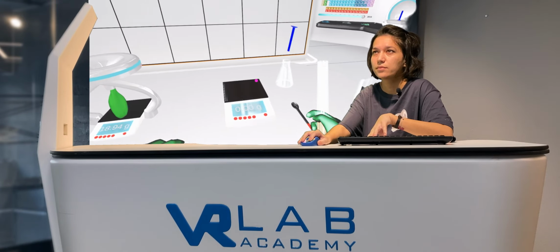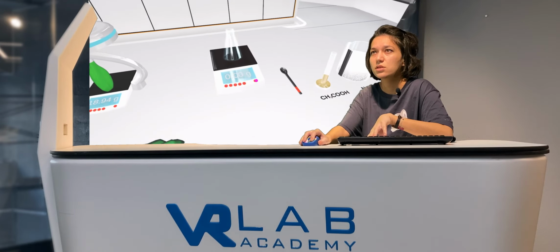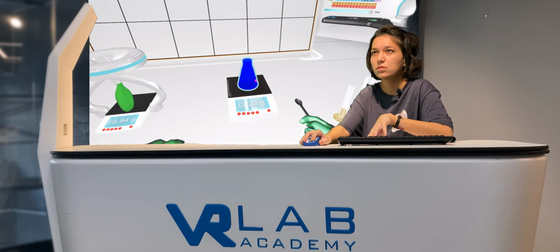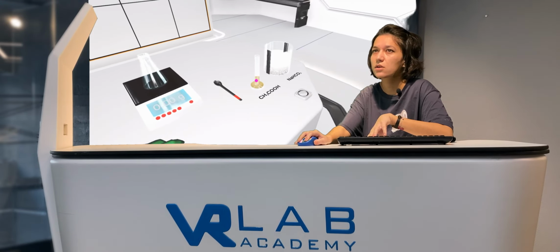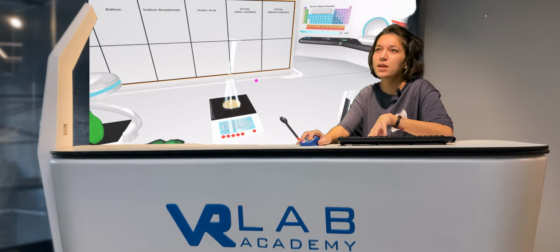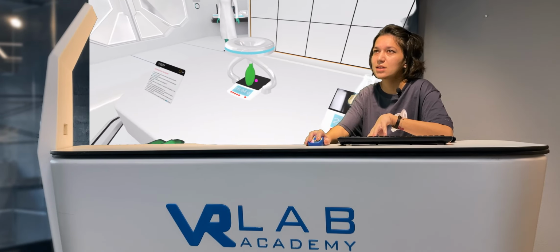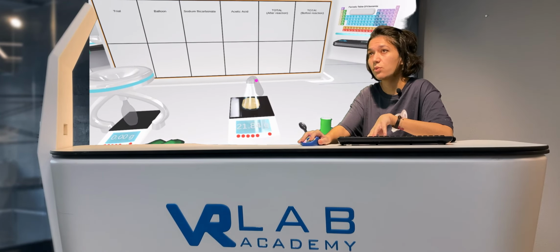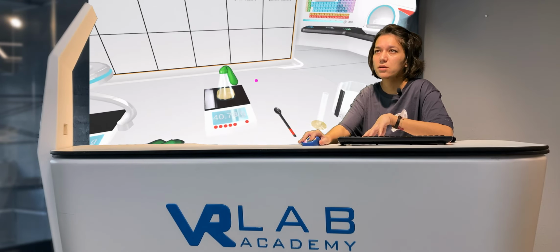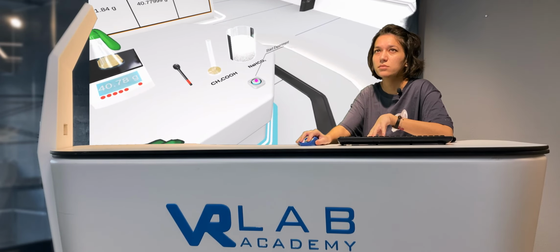I will take this cylinder and put it on the digital balance, put acetic acid in it, weigh the acetic acid that I've put, take the sodium bicarbonate that I have previously weighed, and after all the setup is ready, I will start the experiment by pushing this start experiment button.